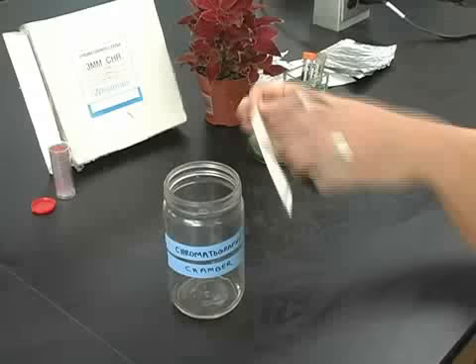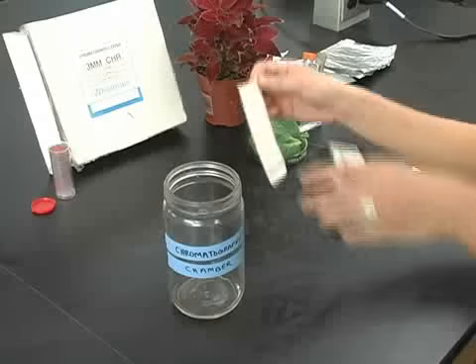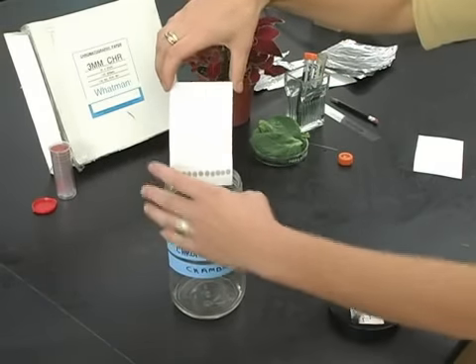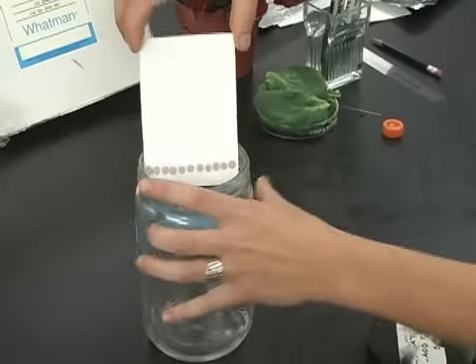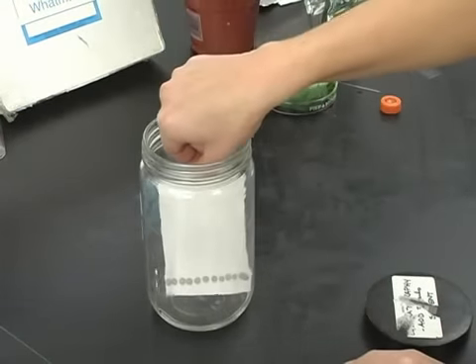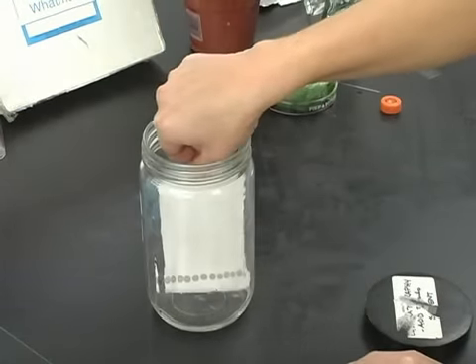This section describes the separation of plant pigments using a technique called paper chromatography. This technique relies on the fact that all photosynthetic organisms contain pigments. Pigments are receptors of the light energy that is needed to drive photosynthesis.